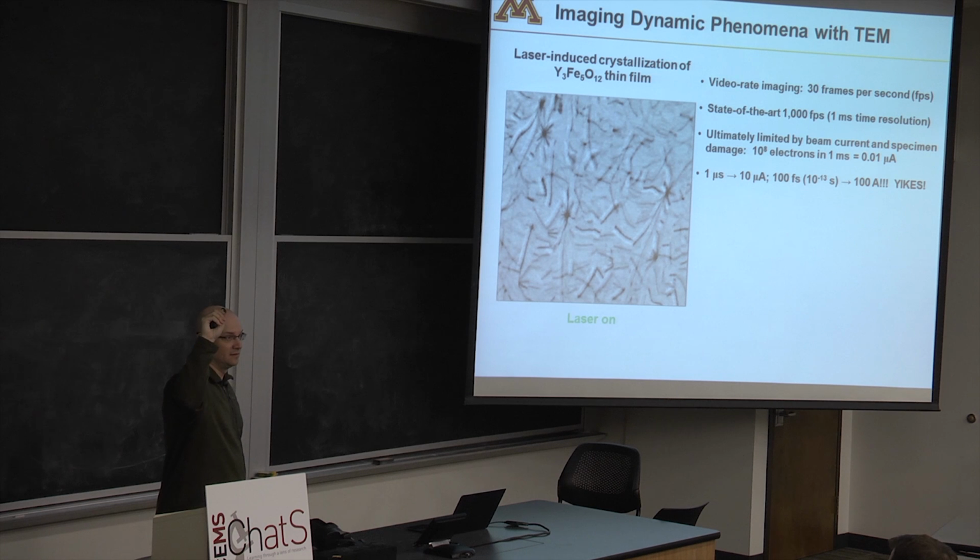That's flying. That means whatever you're looking at does it 10 to the 15 times in 1 second. What? Right? So this is the time scale that it takes if you have a water molecule, hydrogen, oxygen, hydrogen. It's the time that it takes the oxygen and the hydrogen to expand and then contract once. That's about 10 femtoseconds, okay? So that's what we're talking about here. That's what I want to get to.